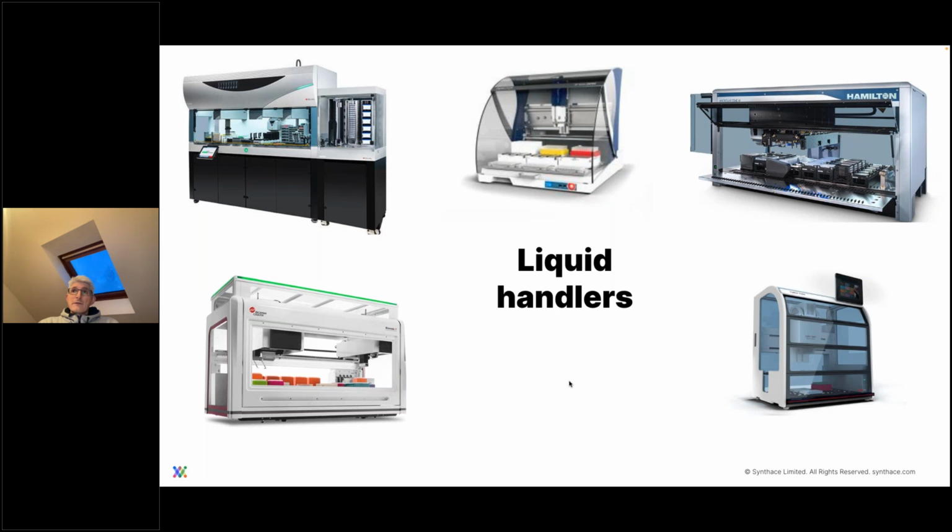The disadvantage that we found when we're running DOEs with this kind of equipment is that especially when you're looking at low volumes, then to get accurate transfer of liquids, you need to aspirate from your source volume, but then you need to go and actually touch the tip into the liquid that you're then dispensing into so that you actually get an accurate transfer and you don't get like the droplet hanging on the end of the tip or whatever. So then that tip's now effectively contaminated with the destination contents on the outside of that tip, so you have to go and eject it.